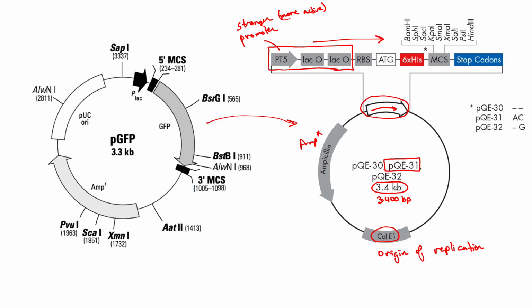So we've got competing demands here. On the one hand, we as scientists want to produce a lot of this GFP so that we can collect it and study it. On the other hand, the cells become unhealthy when we produce a lot of GFP. So here's the solution. We're going to use this part of the plasmid to be able to control when and how much the GFP is turned on or produced. This is called a lac operon.